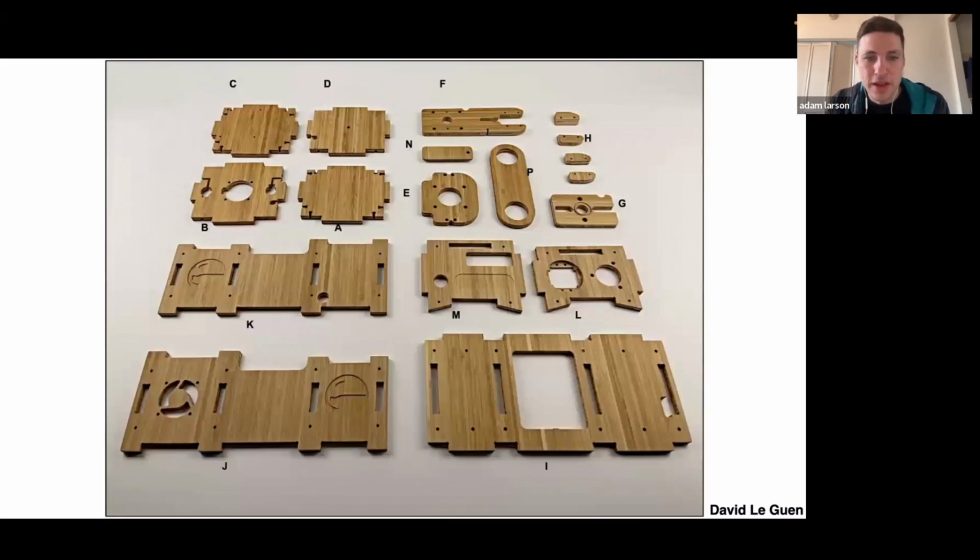which can be made in any of these maker spaces that have a CNC machine. And we focused on trying to make it out of the most sustainable yet reliable and durable material. And we made it out of this, right now, this bamboo, which is actually bamboo flooring, which is really incredible. It's great to machine, as well as being really durable and actually waterproof.